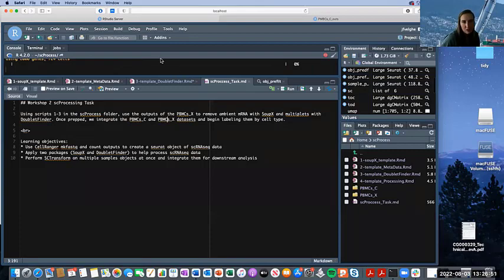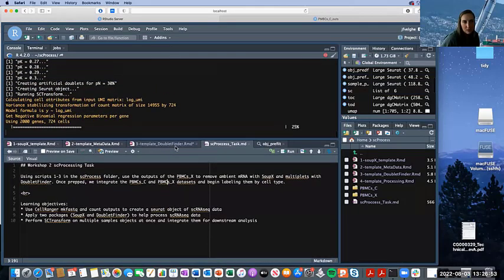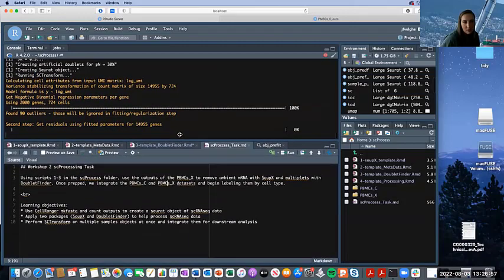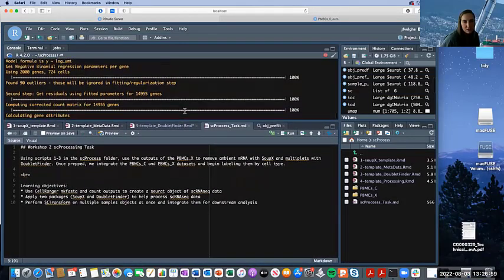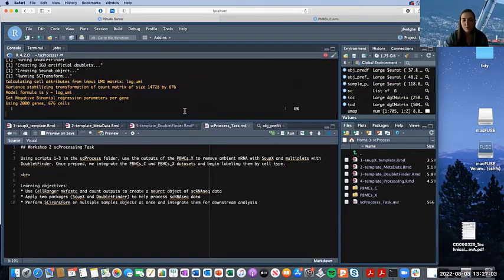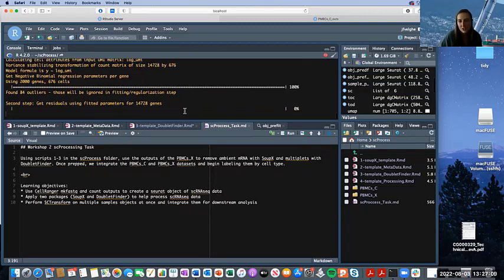This is actually, I think, almost done. So we might actually be okay. Yeah, so that'll be the task to do, your take-home assignment if you want. And again, it's going to be really simple. You're just changing the names of things and getting that to the point that it can be integrated.